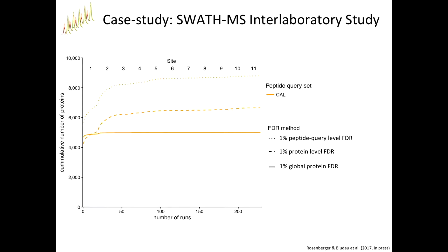So you might think you're controlling it at a 1% FDR, but it's plus or minus 5%, because your variance is so large. That's the hidden consideration. It's very difficult to ascertain with these methods because you only have a single fixed set of decoys. But could we extract another set of decoys, or another 10 sets of decoys, and look at the stability of that?